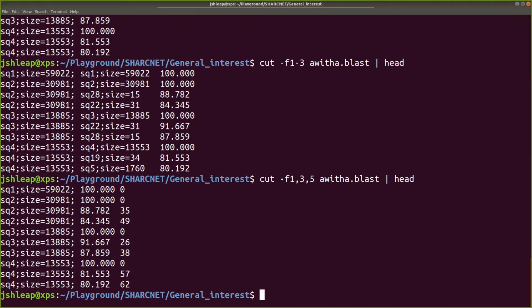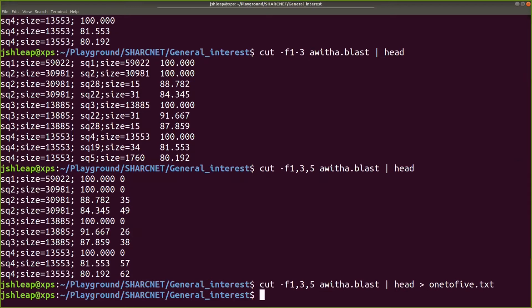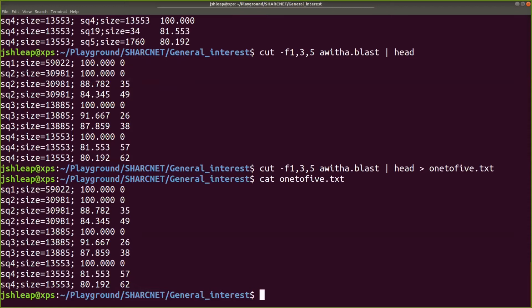And if we want to create a new file with that, then we can do the redirection that I already showed, like 1 to 5, for example. And then I have 1 to 5. Of course, it's not exactly 1 to 5, but you get the gist of the thing. Basically, cut will cut on tabs. This is very important. It's only for tabs like this.